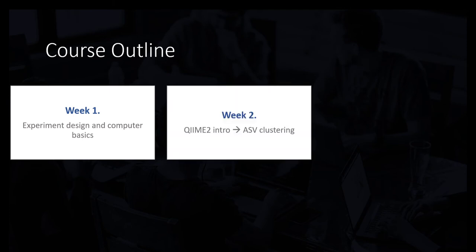The course is going to occur over the next 6 weeks. This week one, we're going to just do this intro and talk about the experimental design with Mary Lou. I'm going to teach some computer basics, so this is fairly basic. Then in week two, we'll look at QIIME2 itself.